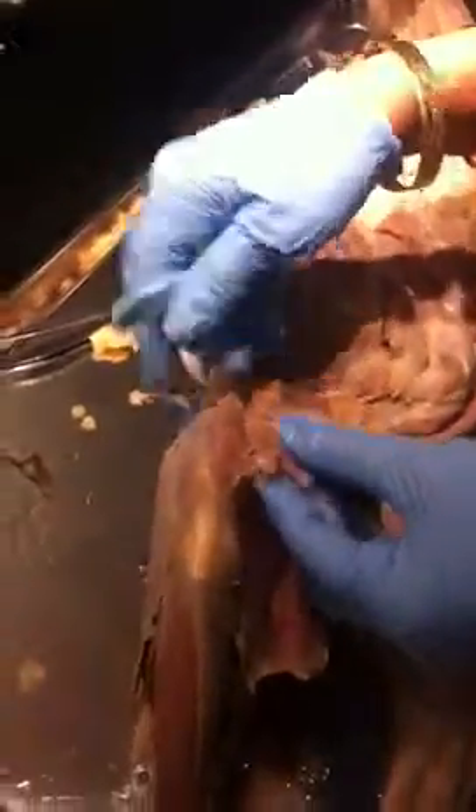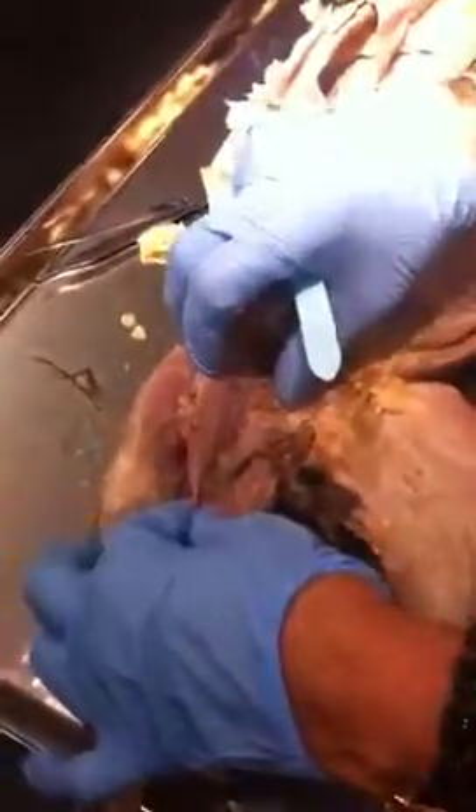Sartorius is on the lateral side, gracilis is on the medial side, and these two muscles cover the whole surface of the anterior part of the thigh.